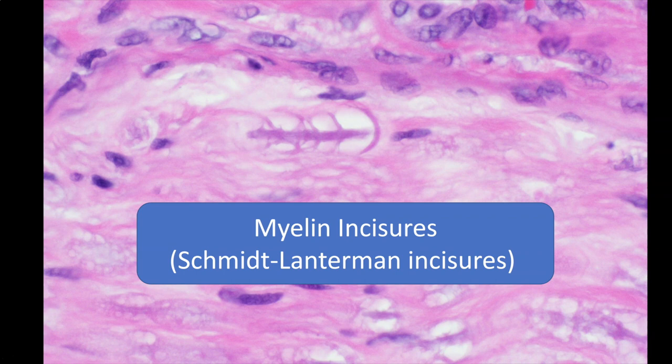The idea of what Schmidt-Lanterman incisures are is really quite cool. Remember, Schwann cells — whose nuclei are visible here in the background — wrap the nerve in myelin. Schwann cell cytoplasm has to stretch out and wrap around the nerve in layers to build that myelin. But somehow that cytoplasm, as it wraps around, has to come back out and connect to the Schwann cell nucleus. Schmidt-Lanterman incisures are essentially the exit area where layers of cytoplasm from the Schwann cell escape from the nerve and return to the Schwann cell nucleus. If you Google Schmidt-Lanterman incisures, there are nice schematic diagrams explaining this. And practically, once you see these structures, you know it's a nerve — if you had any doubt whether it's nerve, smooth muscle, or something else.